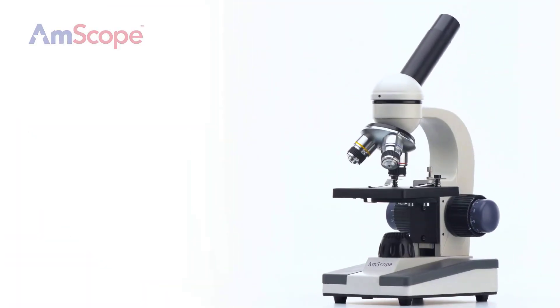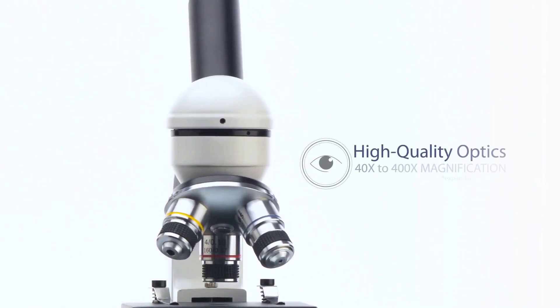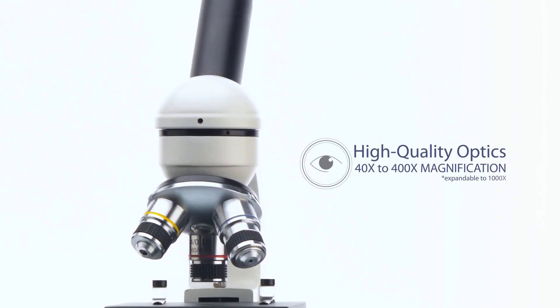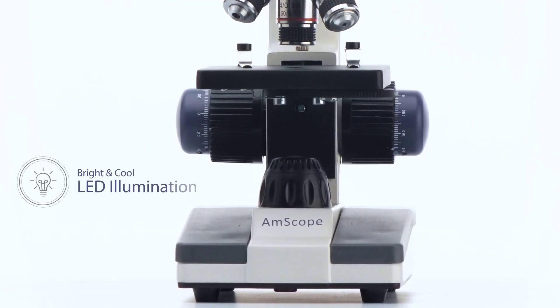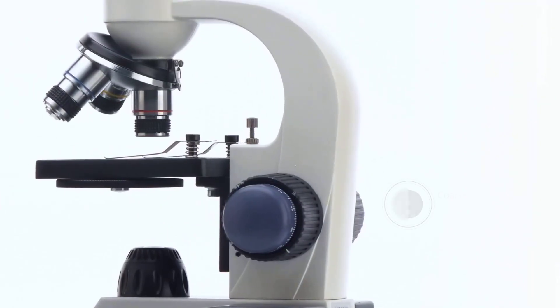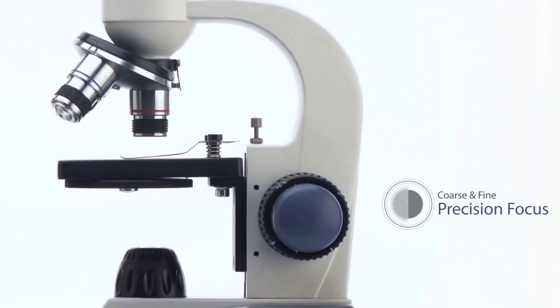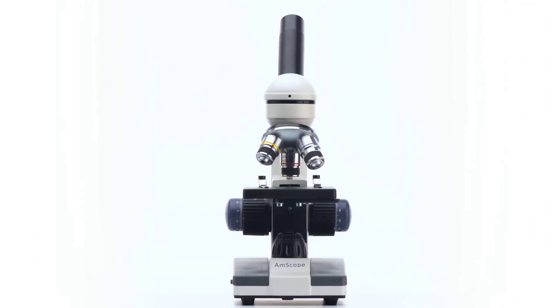Number 2, the Amscope M150 portable LED microscope delivers impressive versatility with its 5 magnification levels ranging from 40x to 1000x, making it perfect for examining specimens from plant cells to microscopic organisms. Its standout portable design allows both battery and plug-in operation, setting it apart from conventional microscopes. The convenient carry-anywhere functionality proves invaluable for field research or young scientists. Built with premium all-metal construction, it maintains stability during use and withstands frequent handling.